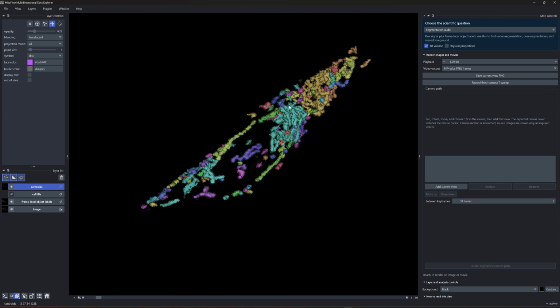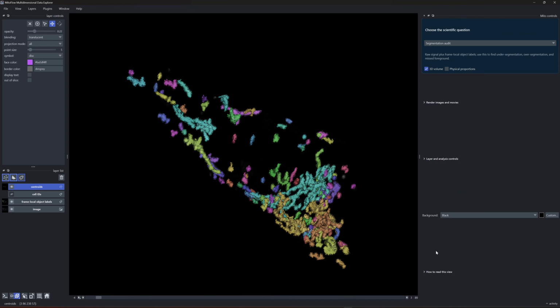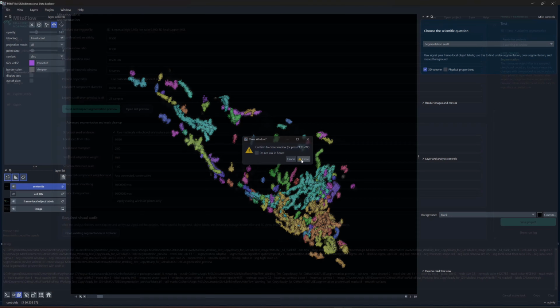So the movements are going to be captured, and you can even play this video and capture the temporal dynamics as well. But that feature is in there too. I'm going to go ahead and jump out of this one. Let's move on to doing the analysis.